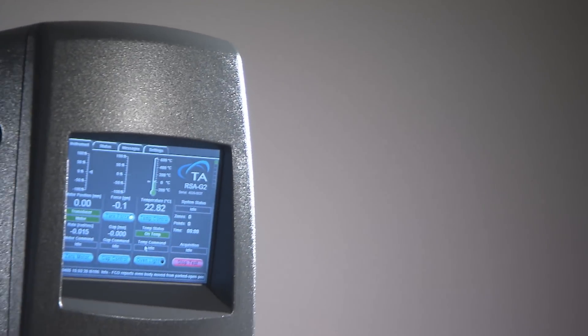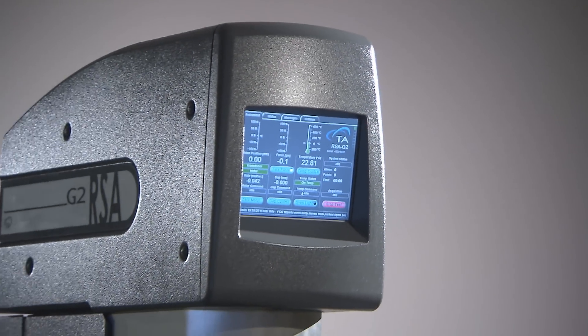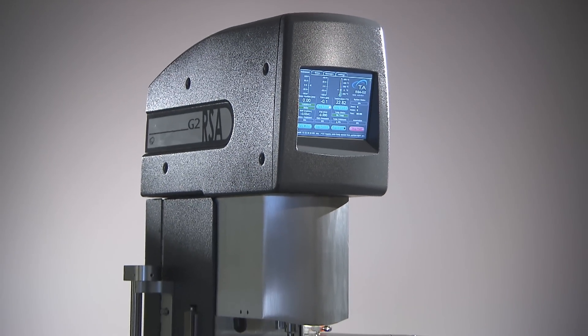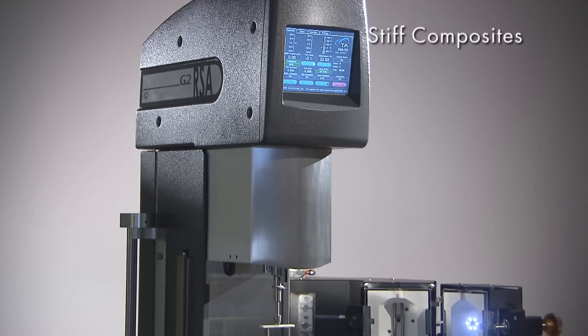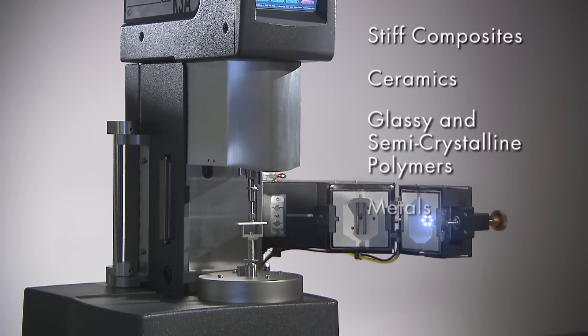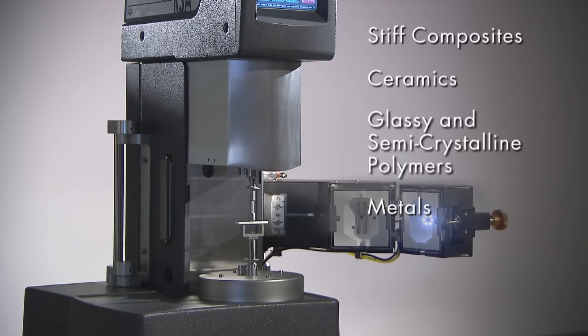With such a broad range of specifications and clamping systems, the RSA-G2 is ideally suited for testing materials ranging from stiff composites, ceramics, glassy and semi-crystalline polymers and metals, to materials of moderate stiffness.